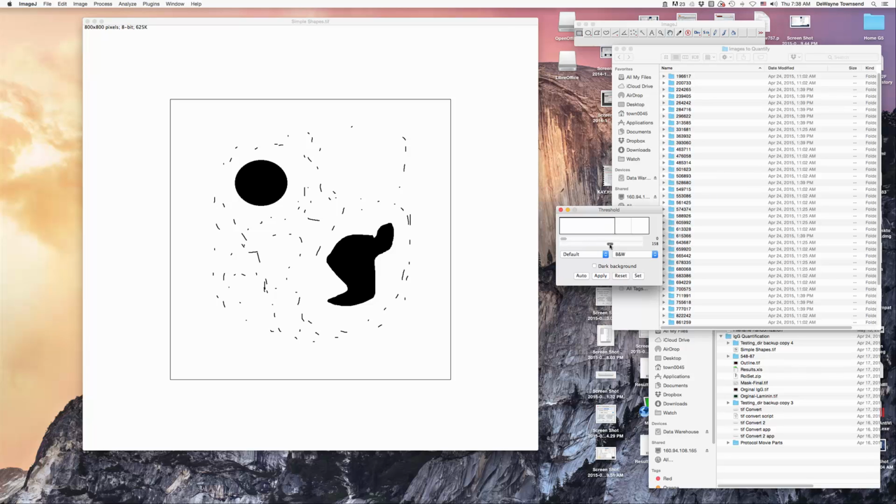If we move the slider all the way down, you can see only the very darkest areas are able to show up. These have an intensity that is super strong and will show up no matter what. But you'll notice we missed this area up here that we were initially trying to catch. So we can then increase this, and we continue. Oh, there it is. Okay, so now we're able to get all three of these areas.